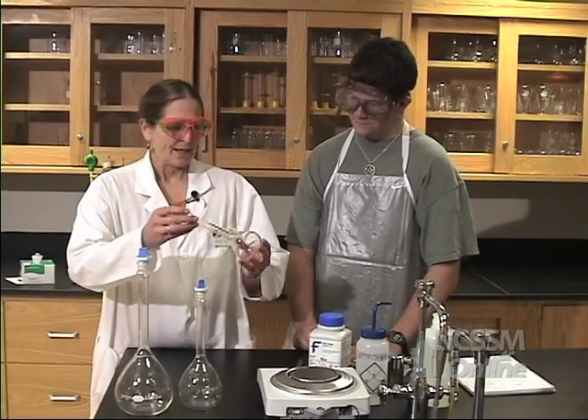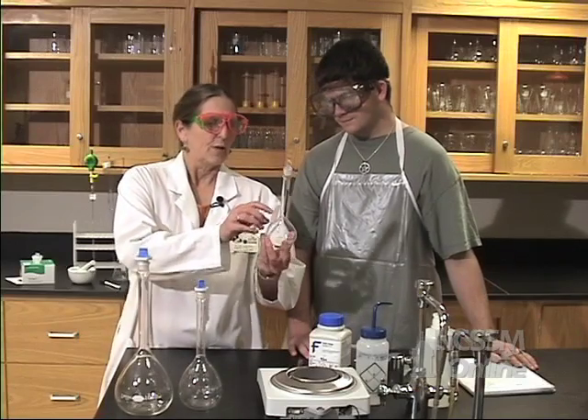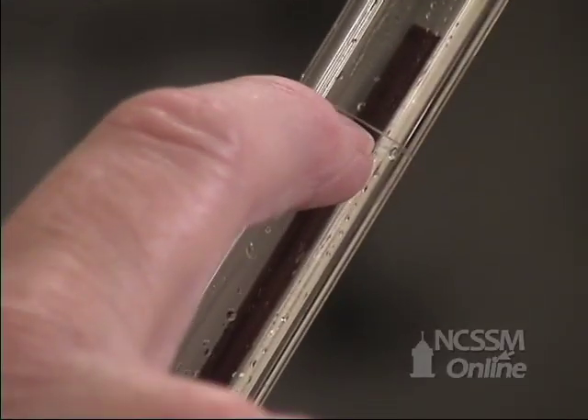Brett, today we're going to make a solution. I asked you to calculate how many grams we would need to make a solution, but first let's look at the volumetric. A volumetric flask is made specifically for measuring out molarity.